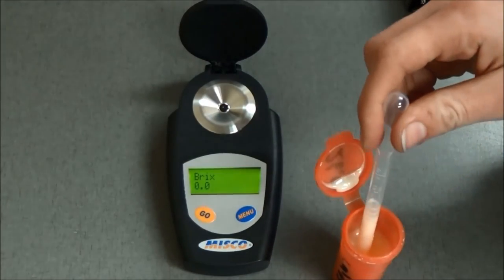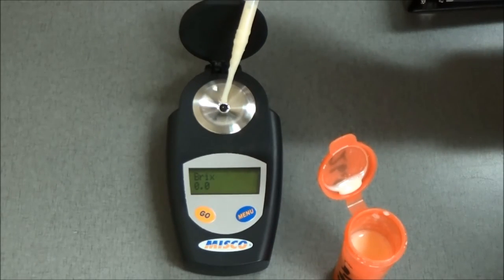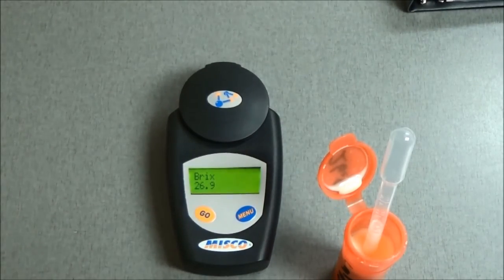Using a plastic pipette, place three drops of colostrum into the sample well and close the lid. Press the Go button. The digital screen will show the Brix reading.